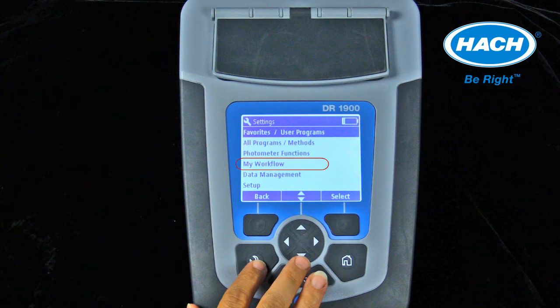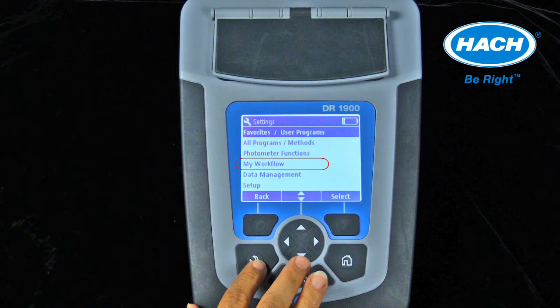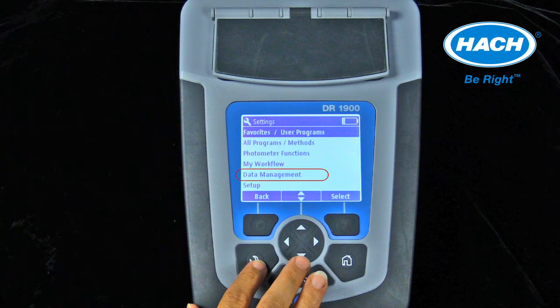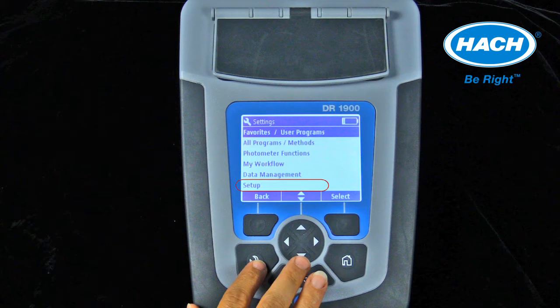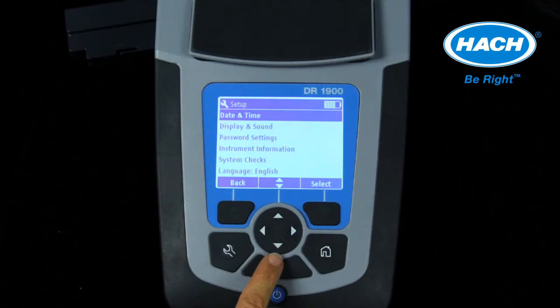A setting to create a workflow allows a sequence of tests to be performed using the same sample ID and operator ID. A data management setting for the recall, sending, printing, or deleting of data files. A setup menu allowing for the settings for the correct date and time, display and sound features, security and password settings, and language settings.